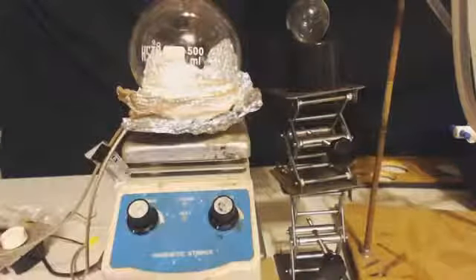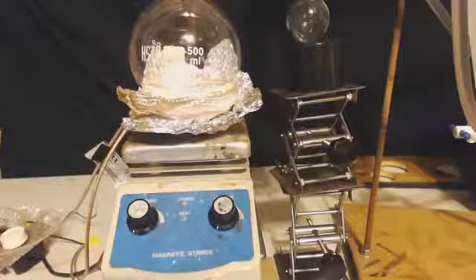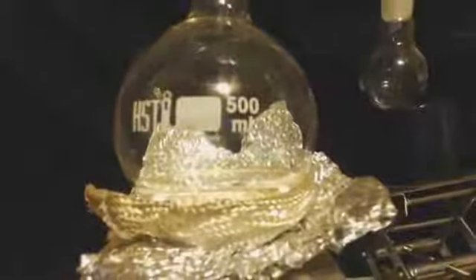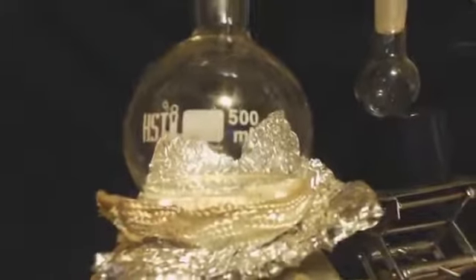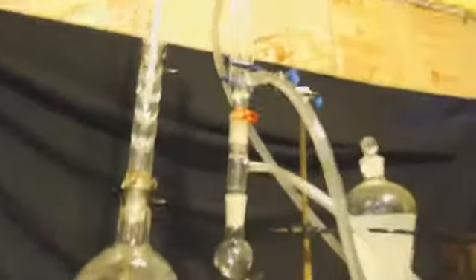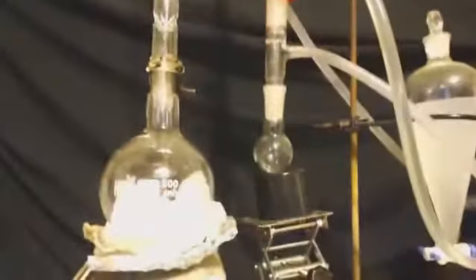Now I'm going to take all my toluene, because it's not all toluene. I'm going to distill it. I'm going to use a Vigreux column. You can see I got my heating mantle there, stir bar. That's all my toluene. Goes straight up, comes back down at a 180 degree turn through the condenser and down to that little round bottom flask that will collect all the pure toluene.